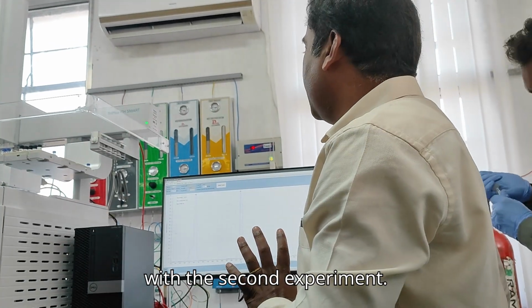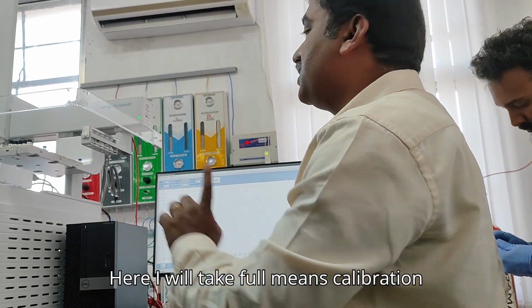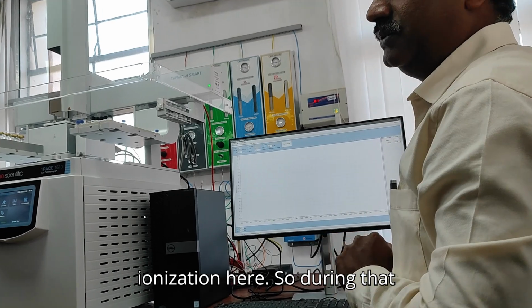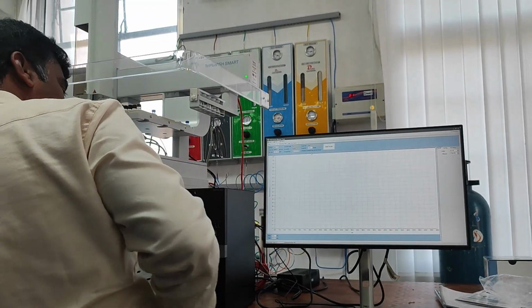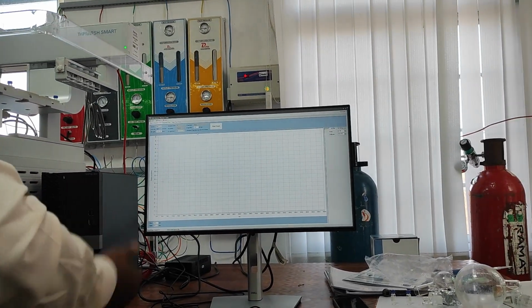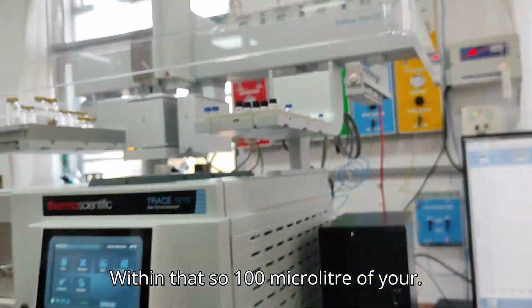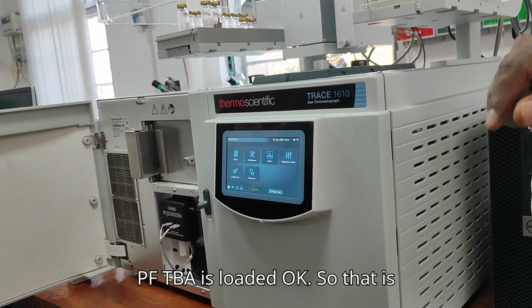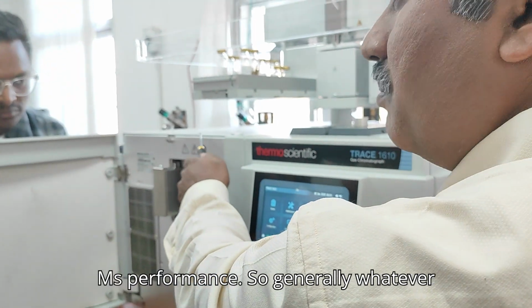So let us go with the second experiment. Here I'll take the calibration gas spectra. I will take the EI ionization here. During that EI ionization, what happens? In the cal gas module, 100 microliter of your PFTBA is loaded. That is your analyte for checking the MS performance.